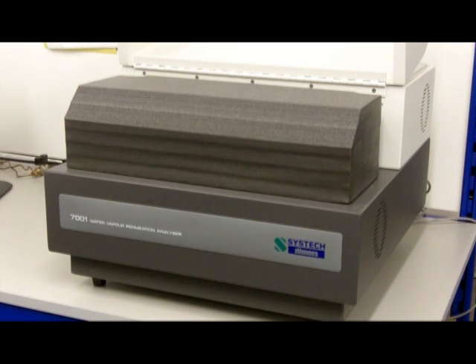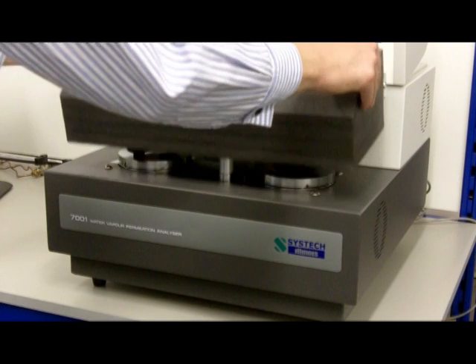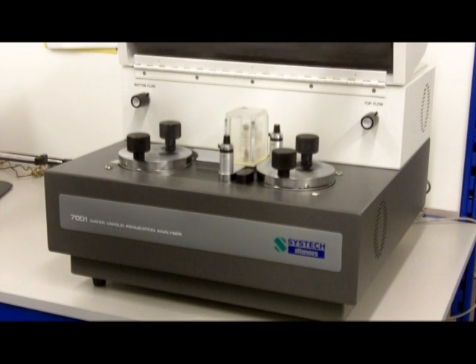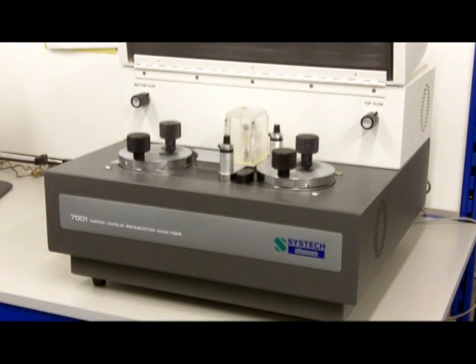Measure two samples at the same time on a single instrument. Here you can see the two sample chambers, or up to twelve samples using expansion modules.